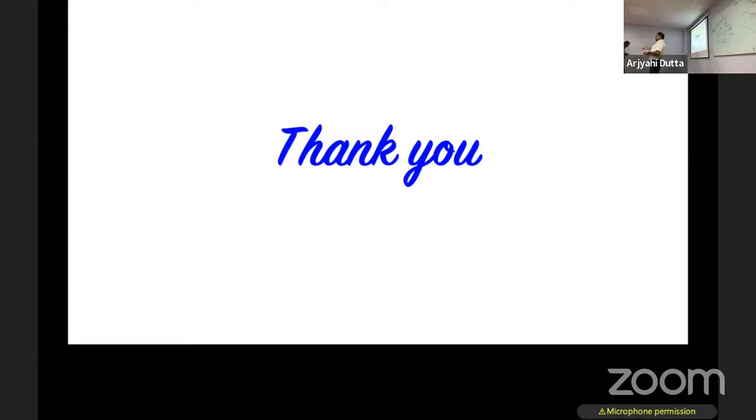But the time dependent thing is difficult. Nowadays there are many new techniques coming for freezing the sample too, where you are not mixing the sample in an eppendorf tube, you are just taking the sample and mixing it on the grid just before freezing. When the reaction goes, at that time you freeze. Then you can see the time dependent thing. So time resolved cryo-EM is one of the important new developments that people can use.